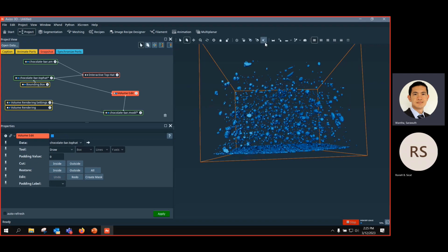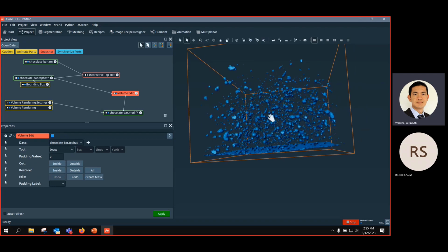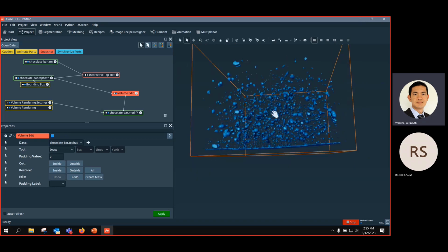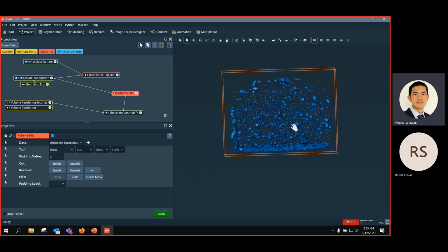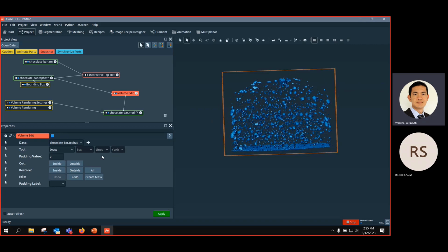And that's why it's important to have the orthographic view, because you have perspective. You don't know if you aligned it very precisely, so you should do it like this. Then you can see more easily that everything is overlapping, and then you can easily cut them. Or if you don't want to draw, you can also use different tools like the tab box.